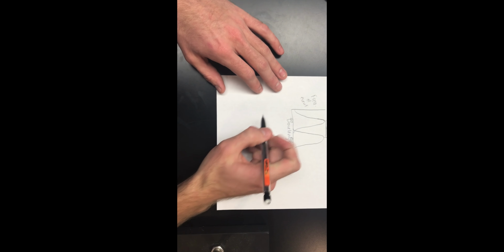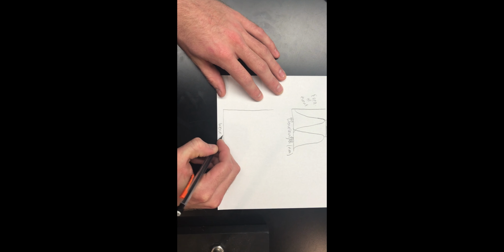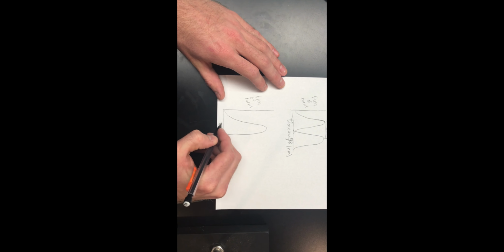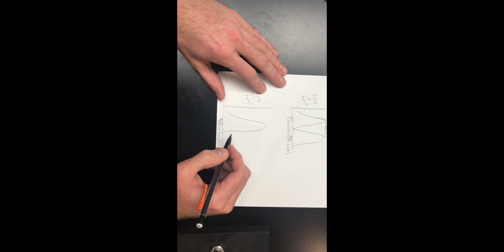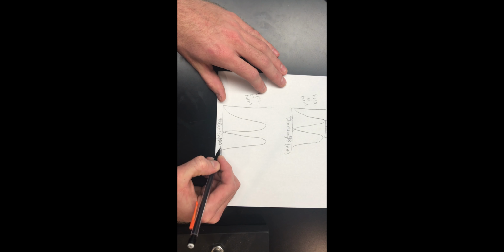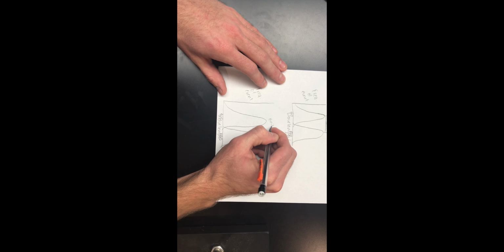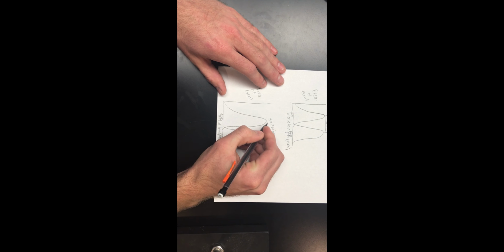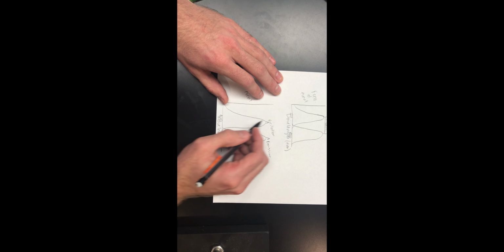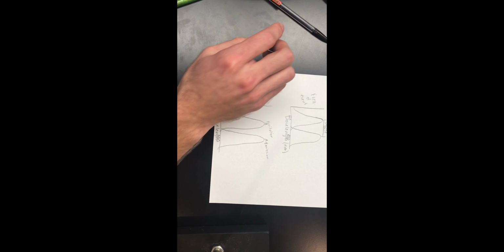So let's take a look at some differences that would occur if we excited with a different wavelength. We'll stick with our natural 620 peak, and we'll show here that optimal peak at 680. This is our emission, this is our excitation, and we'll give this peak an A. We're associating this excitation at 620 with this emission at 680 at those optimal amounts.